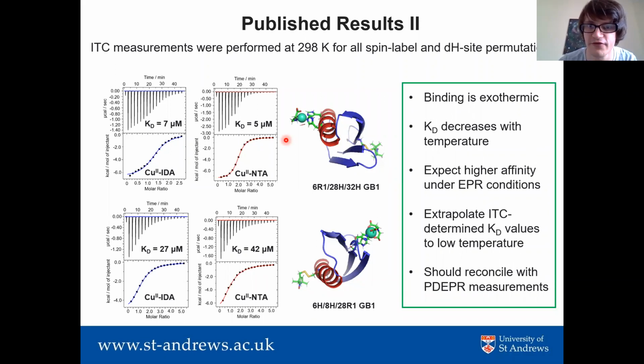I would be very surprised if the surrounding protein structure didn't play a role, but this is something that I think just needs more investigation. At the moment, this is kind of speculative, but in the majority of the proteins that this has been applied to, they have observed reasonably high binding affinities. This is in a number of different systems where they have different binding environments in their secondary structure.